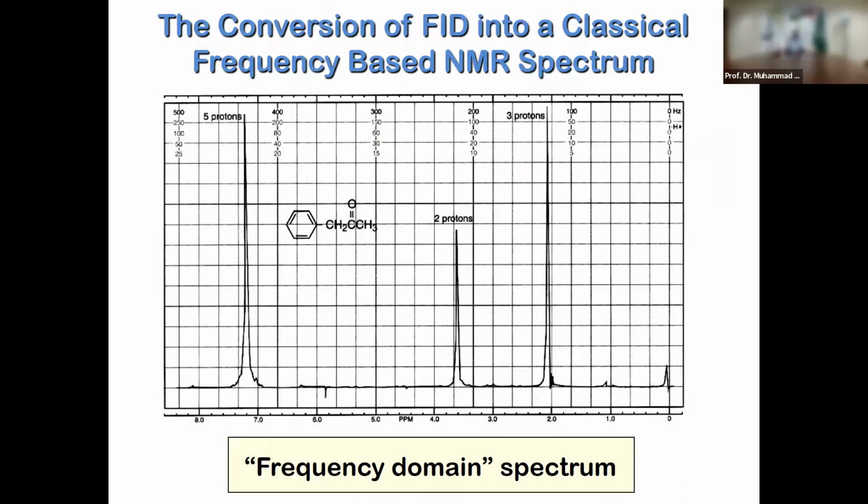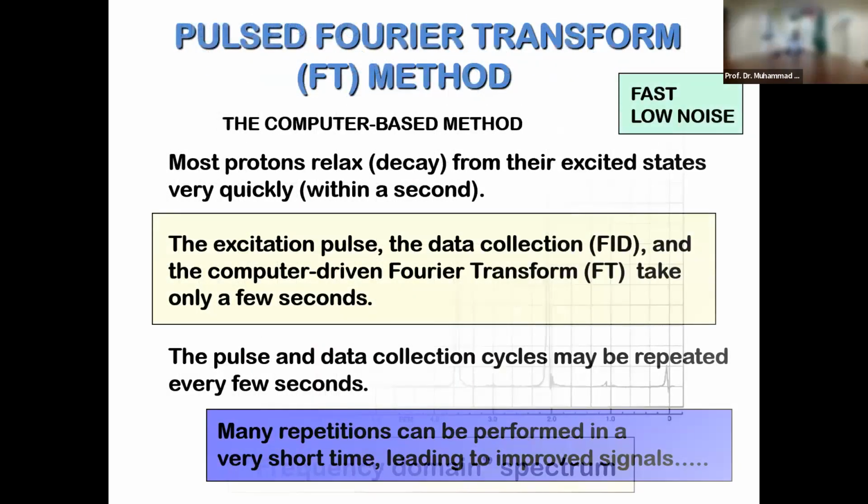So this is the classical NMR spectrum which you get out of a single pulse experiment. And this is pulse Fourier transformation NMR spectroscopy, or PFT NMR spectroscopy.